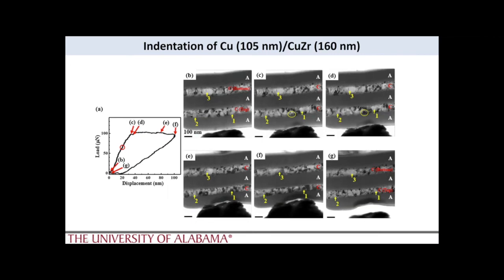upon contact, upon really deformation, the only feature that we see showing some significant contrast change seems to be this region here I've indicated in yellow. But what we do notice is as we indent further and further, we had, for example, a small grain structure, a sliver of grain here, 3. By the time we get to E, significantly into the deformation, we basically have this perfect elastic plastic response. That contrast, I should say, is gone.